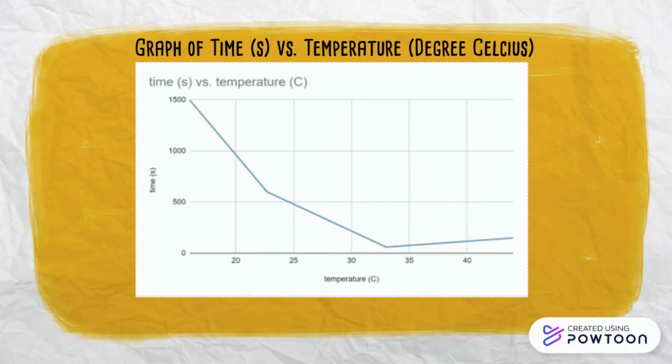Increasing the temperature to 33 degrees Celsius, which is relatively high, results in an increment of heat, which, as we know, increases molecular motion since the reactant molecules begin to move faster and become more likely to collide with each other, causing a reaction between the enzyme and the substrate. This speeds up enzyme activity, reducing the time taken for coagulation to 60 seconds.